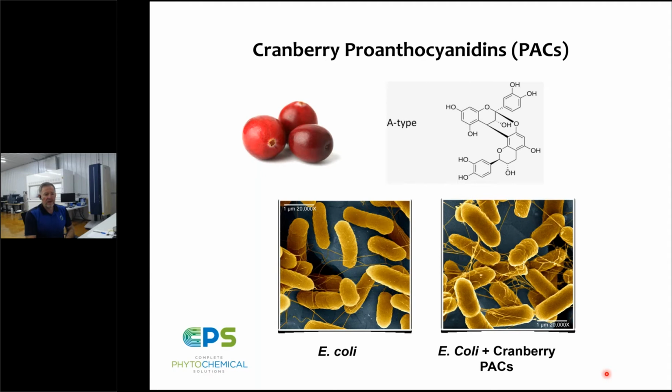And so this is a unique structure-function relationship that is being used to substantiate and market cranberry use in commerce. And so you can get an understanding of why it's important to authenticate this class of compounds. If this cranberry product were to be adulterated with a class of compounds in which there were no A-type interflavan linkages, this agglutination event would either not happen or would happen at a reduced level. So this is a good example of a fit-for-purpose approach in which the class of compounds that demonstrate the biologic activity are the directed focus of authentication.